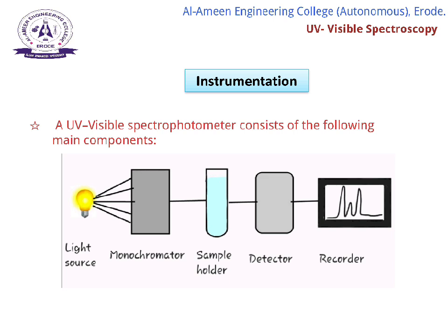Next, monochromator. It separates polychromatic light into individual wavelengths using prisms or diffraction gratings. It allows selection of specific wavelength to pass through the sample. Next, sample and reference cell. Usually, it is made of quartz. One cell holds the sample solution and the other contains the reference, that is solvent.